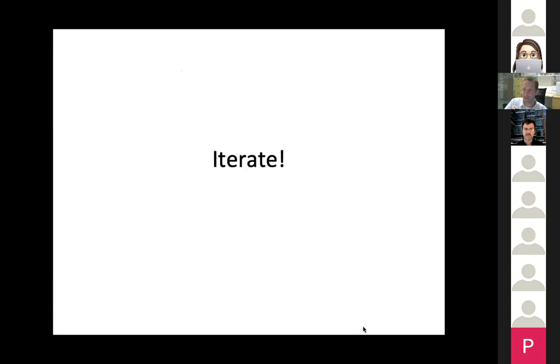And as I said, this becomes an iterative process, because the refinement leads to better angles and offsets, and then the frame alignment and the CTF refinement lead to better tilt series alignment, beam-induced motion tracks, and CTF parameters like defocus or the aberrations. So you can go back and forth.